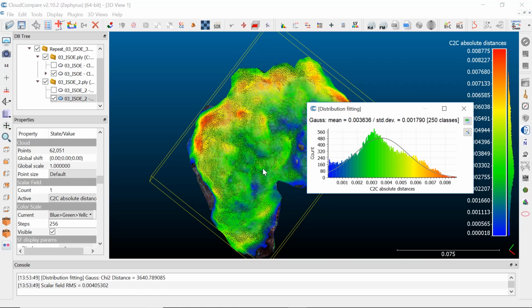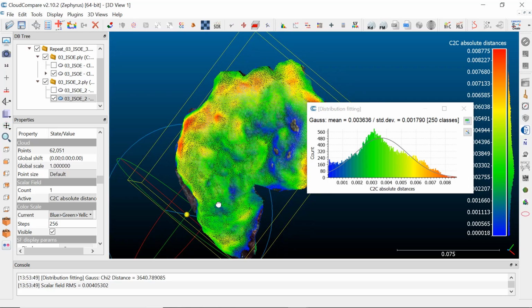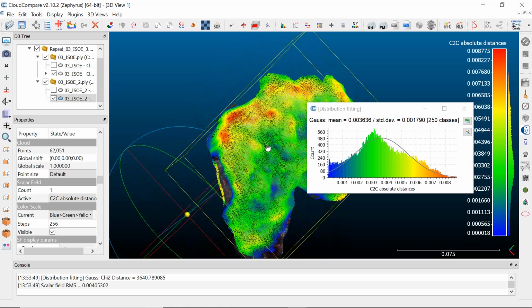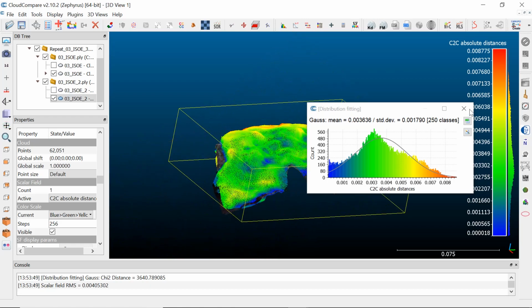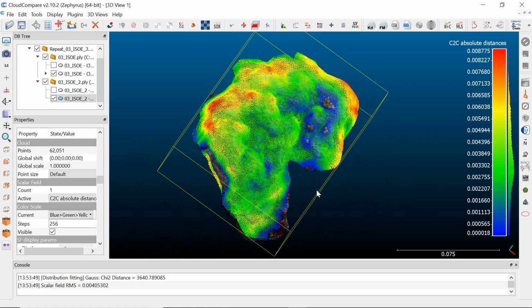So it really depends what you look at. If you want to know about space occupancy, for example, looking at radial extension makes sense. But if you calculate calcification, for instance, you want to know both of these rates, yet usually these are not available. So this 3D modeling is a really elegant solution to get both of these for encrusting colonies.